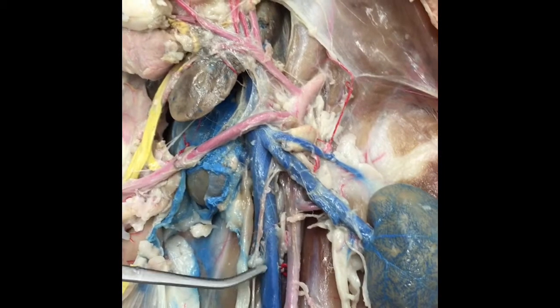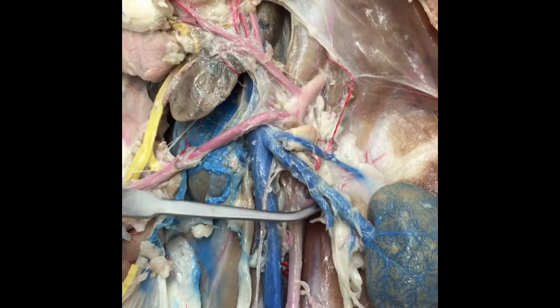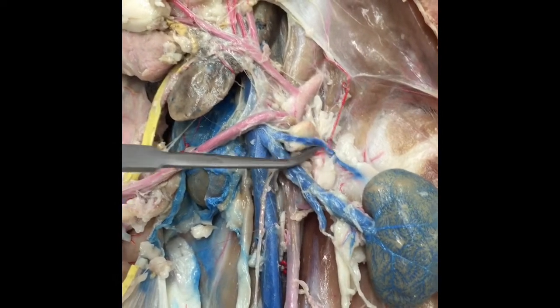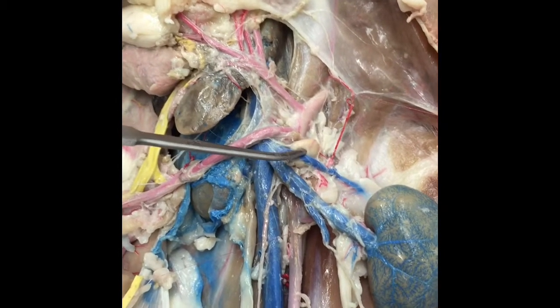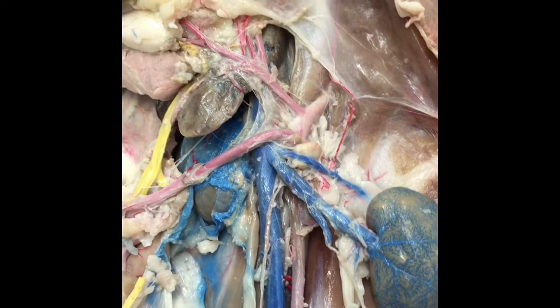The blue one. This one, sorry. And then this is the renal artery and vein, the veins below it. And then this is the adrenolumbar artery and vein. And then that's the adrenal gland. Oh, and this little thing is the adrenal gland. This is a continuation of the dorsal aorta.